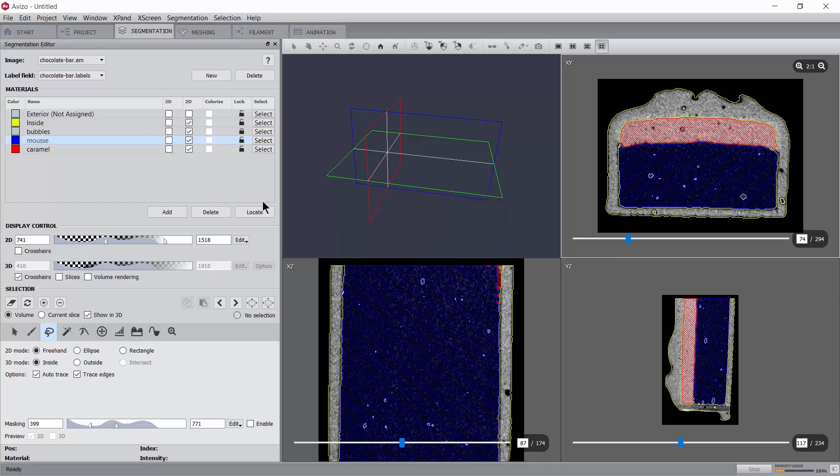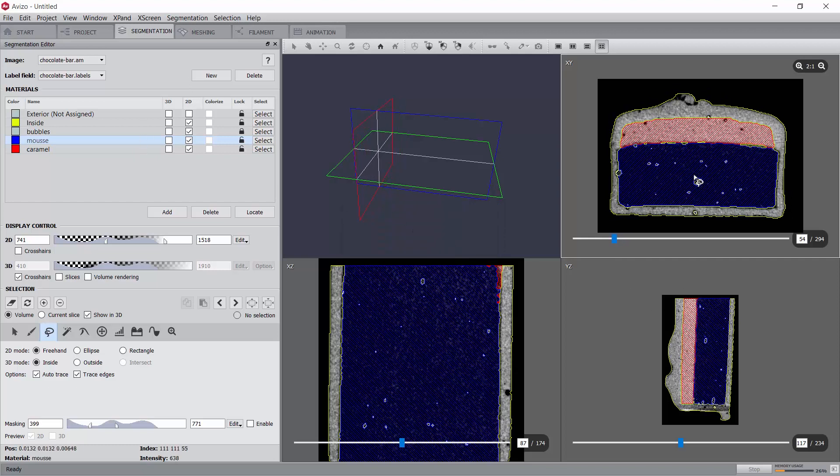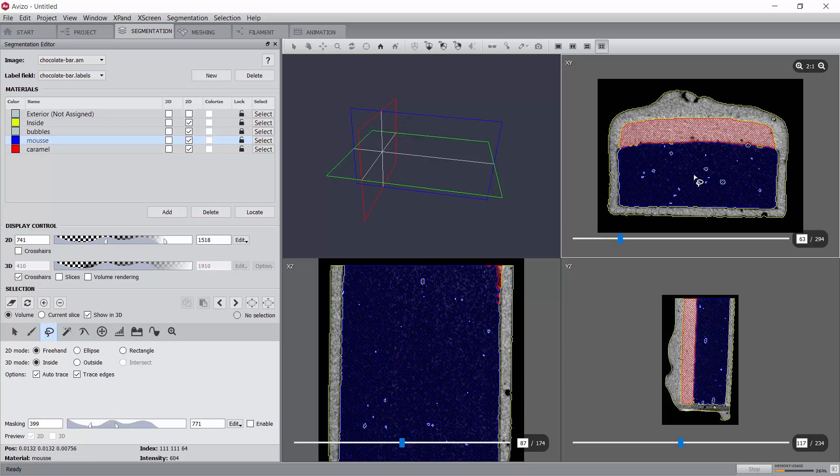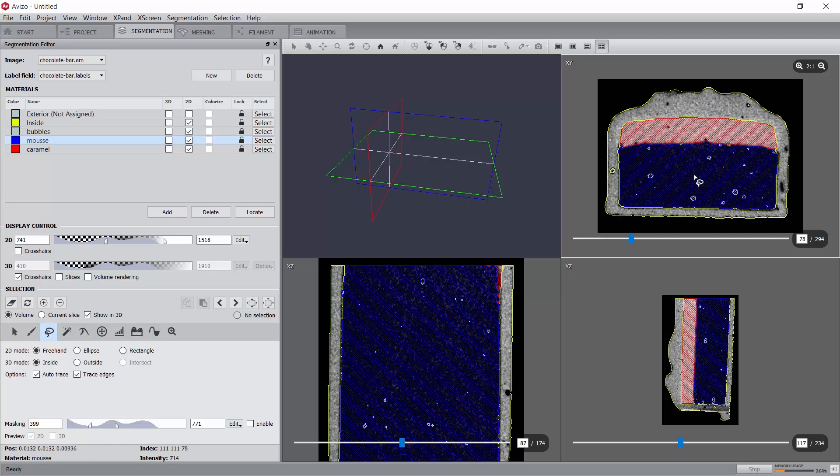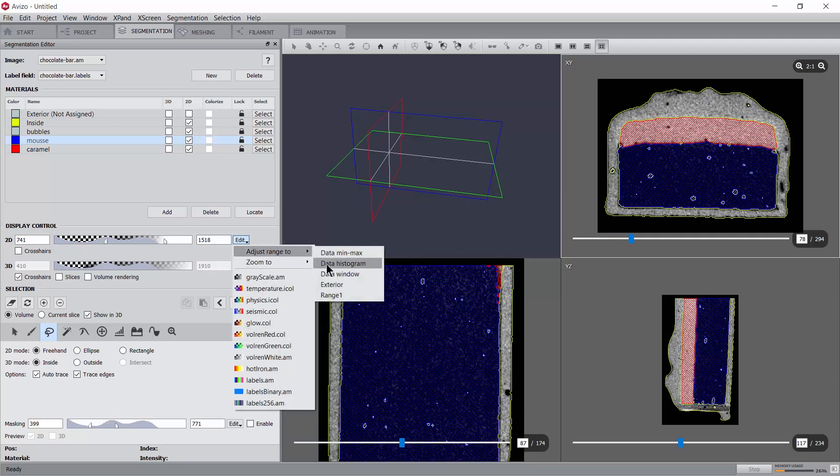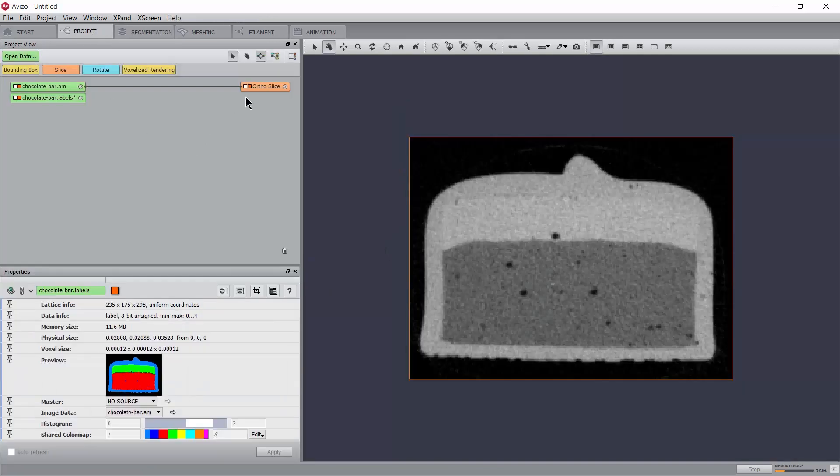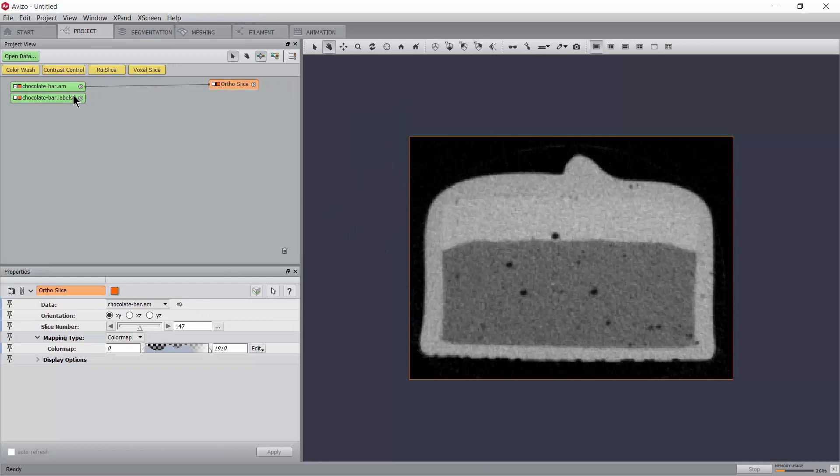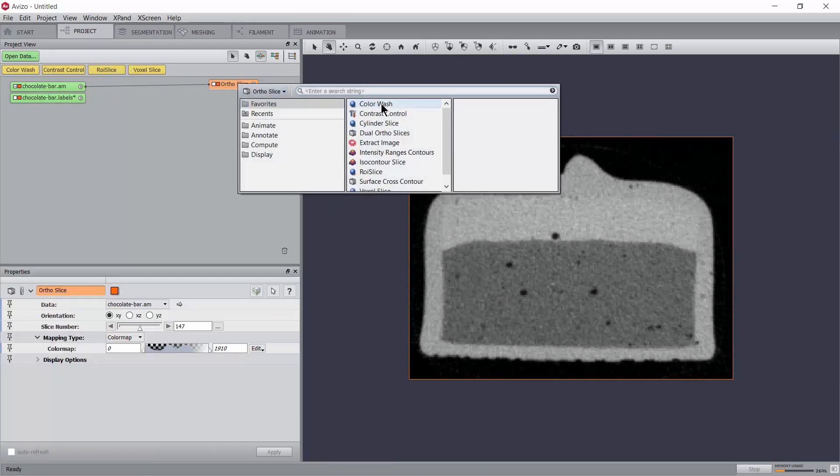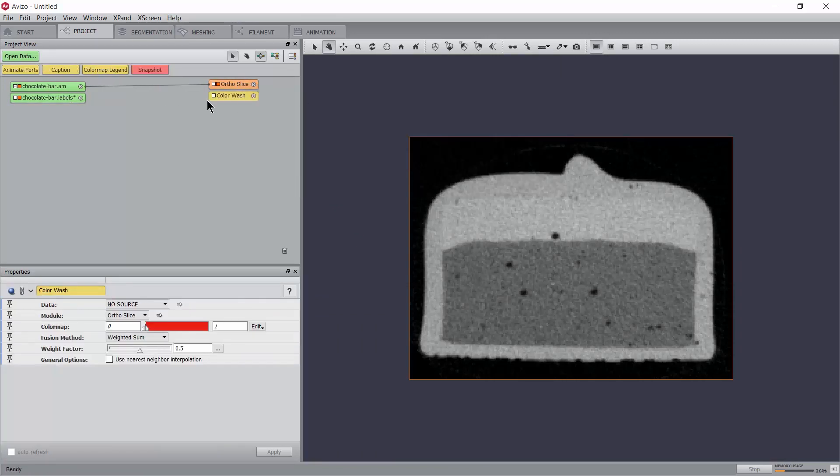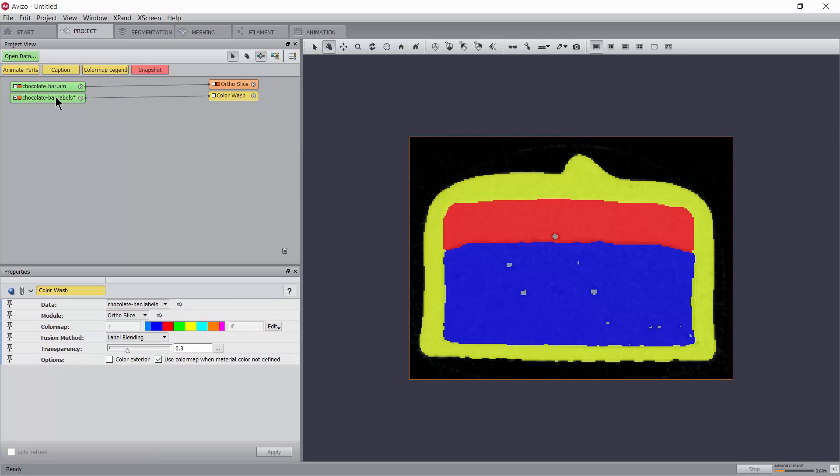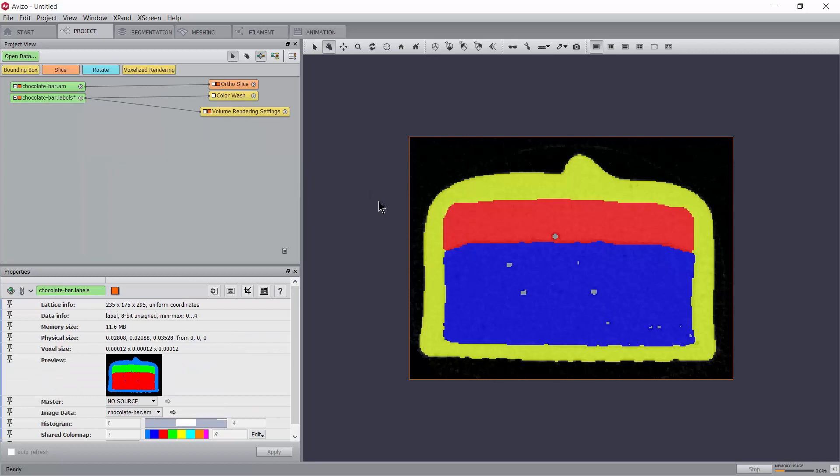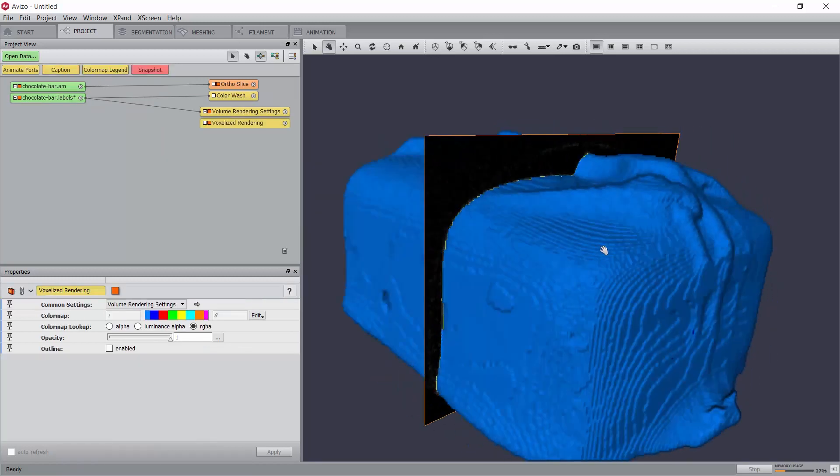Of course, different types of images may require different strategies for performing the segmentation efficiently. More advanced interactive segmentation techniques are also presented in other tutorials. At this stage, the user can now come back to the project workroom, for example to visualize the segmentation data, or to carry on with quantification or surface generation. These possibilities are also covered in other tutorials.